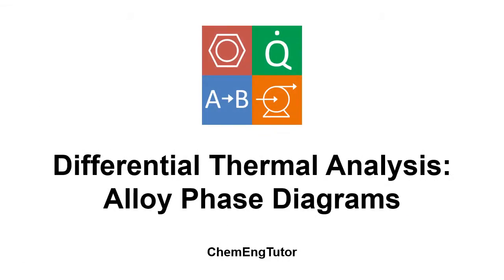And so that has been a video about the use of DTA to examine alloy phase diagrams.